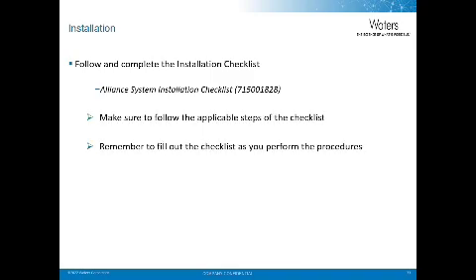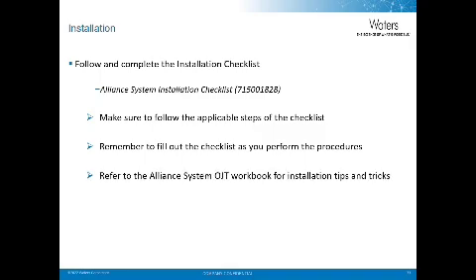Remember to fill out the checklist as you perform the procedures and refer to the Alliance System OJT workbook for installation tips and tricks.